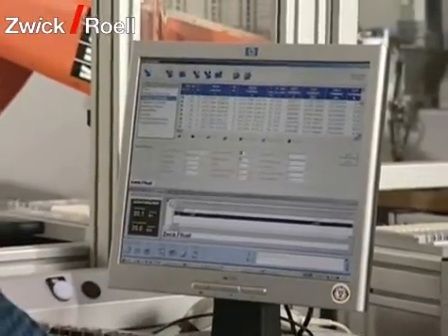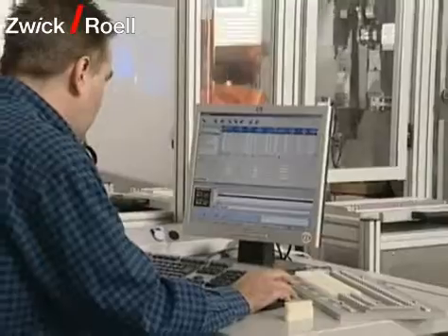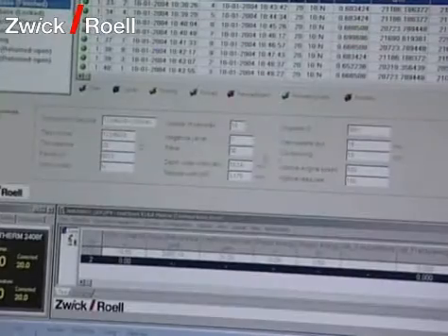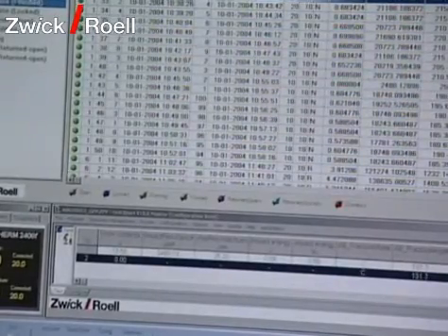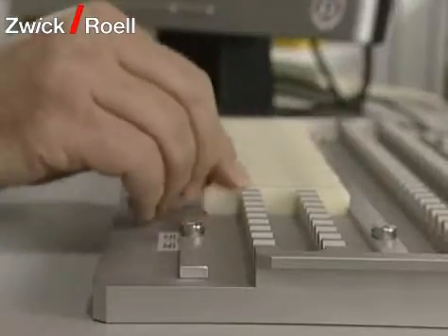Our Test Expert testing program is used for the control of the testing machine. First, the operator saves the specimen data relevant for testing in a database, such as testing temperature and type of testing. Then the specimens are sorted into the specimen carriers.